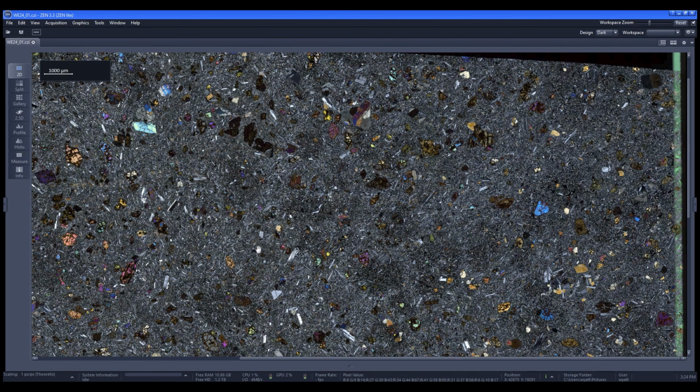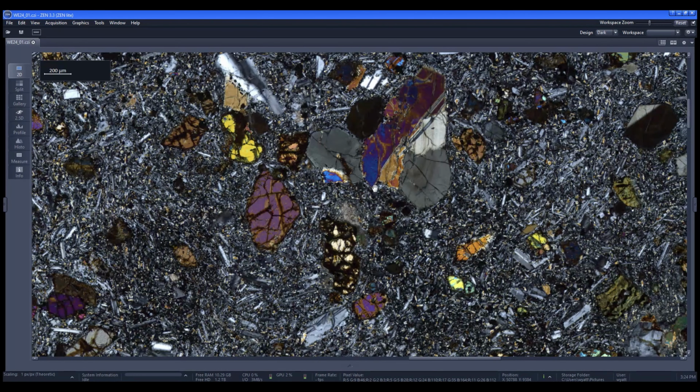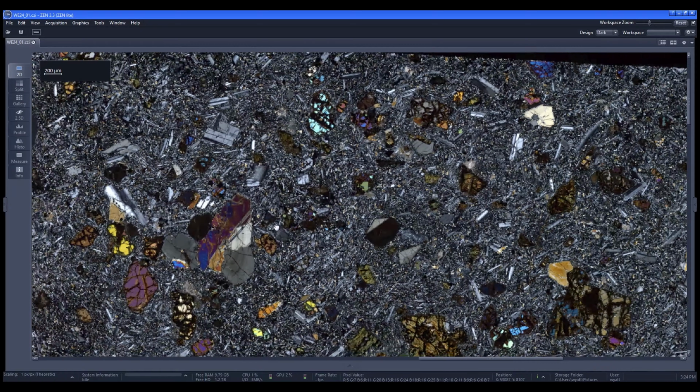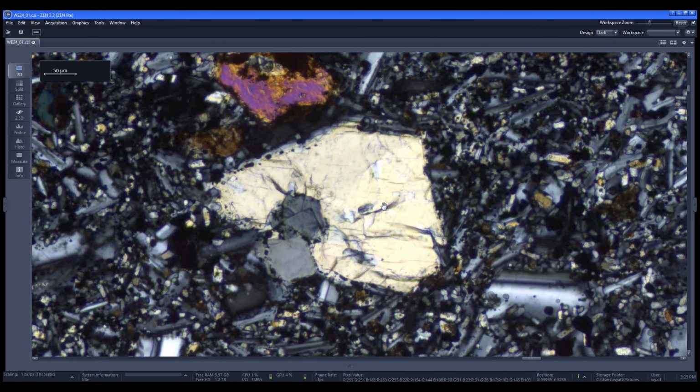There are two different types of pyroxenes: orthopyroxenes and clinopyroxenes. One way you tell the difference is you look at the cleavage, and there's a very specific thing you do with it. In a microscope view, you have crosshairs. You have one line going straight up and down and another line going from side to side. Let's say you found a pyroxene that shows cleavage. We'll just use this as an example. You look at the cleavage lines, and you rotate the stage.